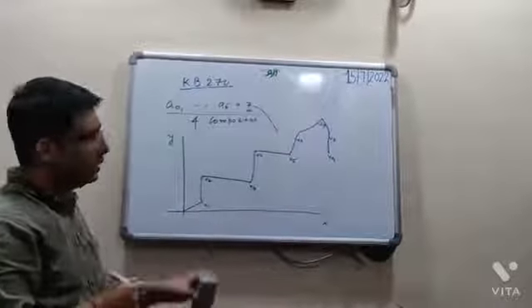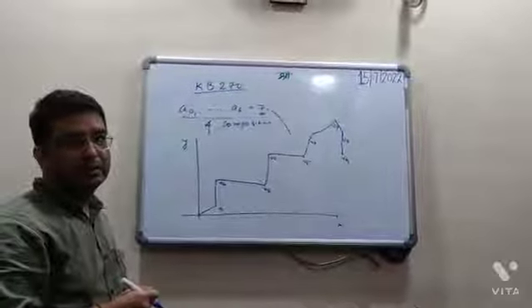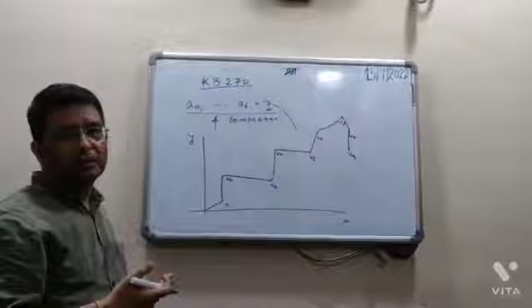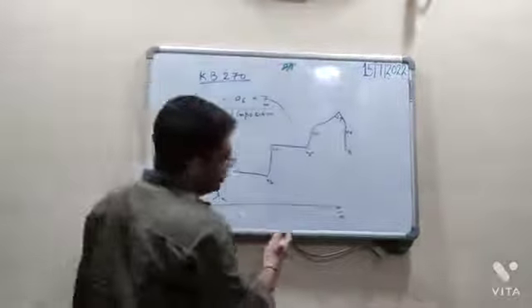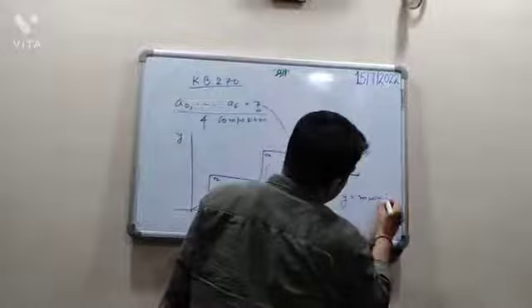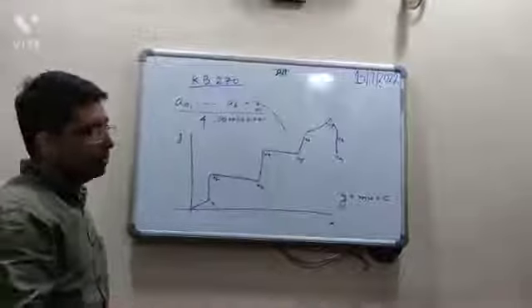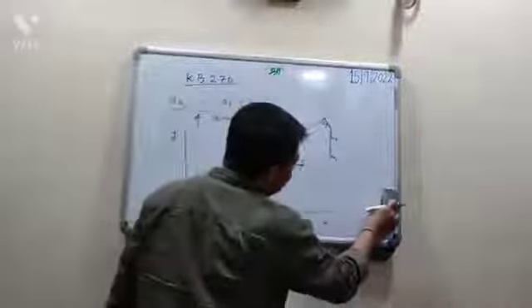Now is it linear? No, it's not linear. So I cannot use the equation y equals mx plus c.